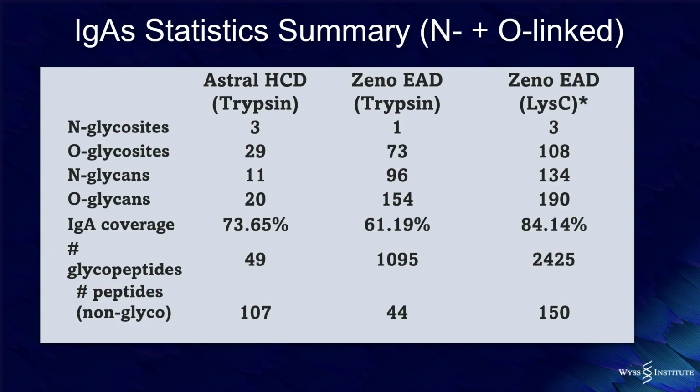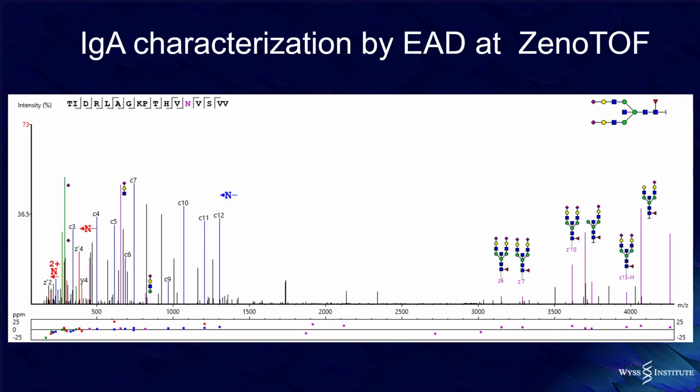And again, Lys-C gives us a little bit of a boost on the coverage, a little bit of extra analysis of the peptide, and you will see later where it was a very critical part of the story. It's not just a percentage increase, but it actually was important for certain cases to see the coverage of the antibody, very critical pieces.